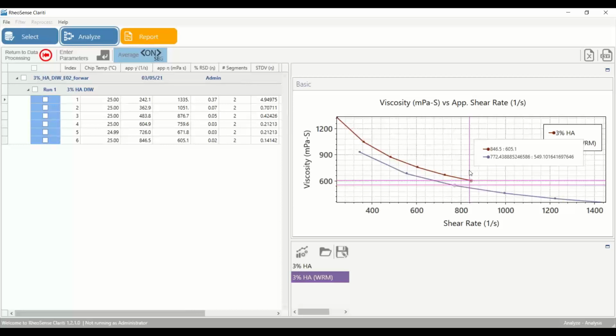And since non-Newtonian fluids, and specifically this shear thinning non-Newtonian fluid, decrease in viscosity as shear rate increases, the output shear rate that the instrument calculated is incorrect, and also the viscosity value that it then calculated is incorrect because the fluid decreases in viscosity as the shear rate increases. However, the instrument measures shear stress, and shear stress is the same whether your fluid is Newtonian or non-Newtonian.